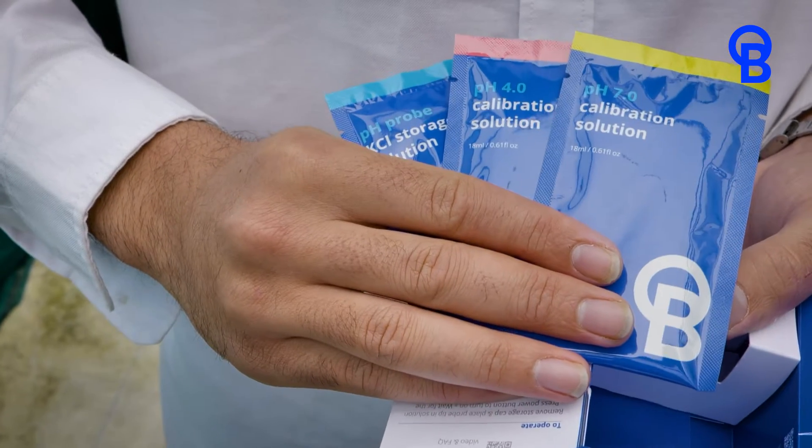When it comes to PH, care and calibration is really important. Our pens are so easy to clean, they're easy to calibrate, and we've also got a 30-day built-in reminder to help you stay on top.